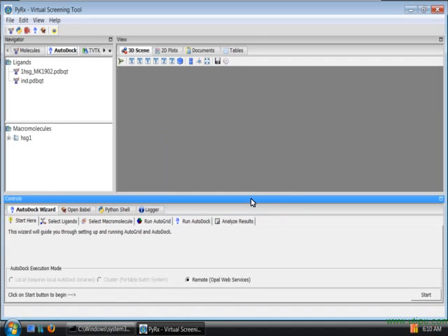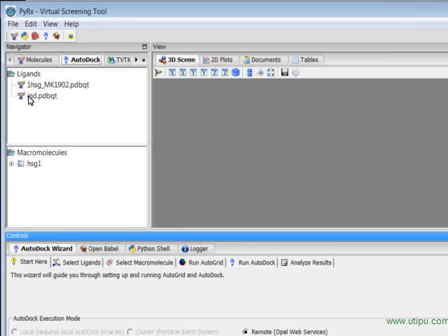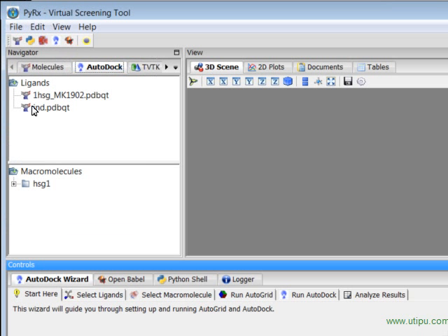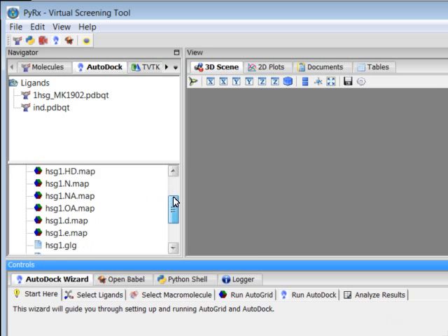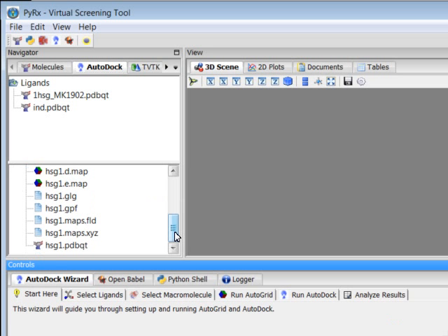When the download is finished we'll see newly created pdbqt file for the ligand and the hsg1 folder where we can see the autogrid map as well as the hsg1.pdbqt file.